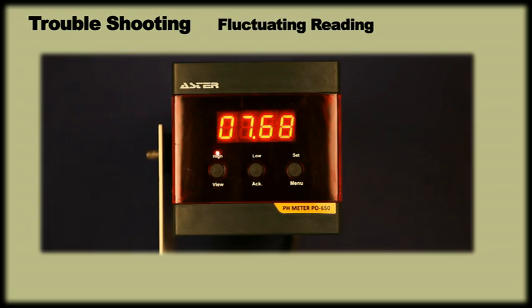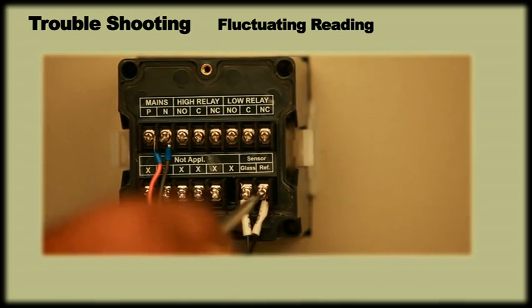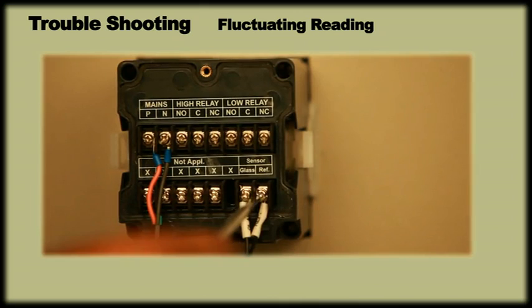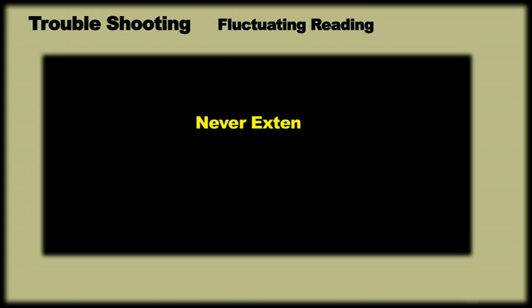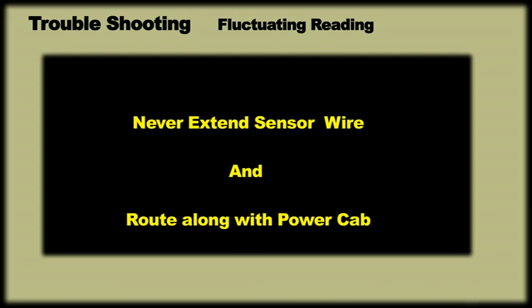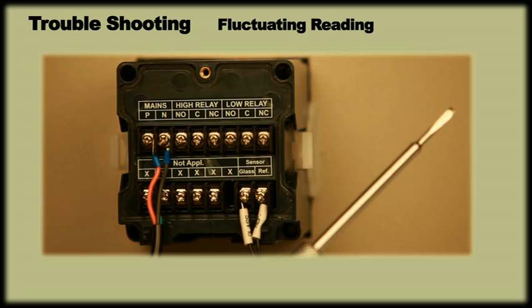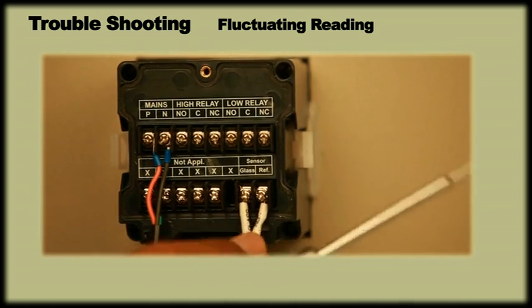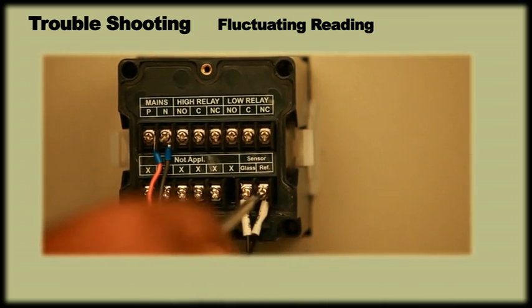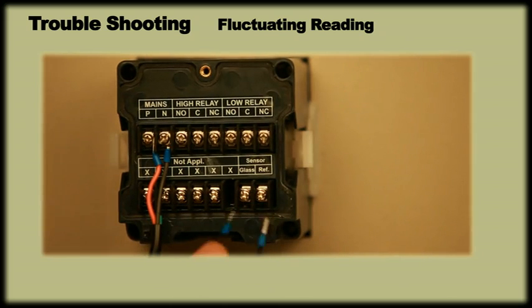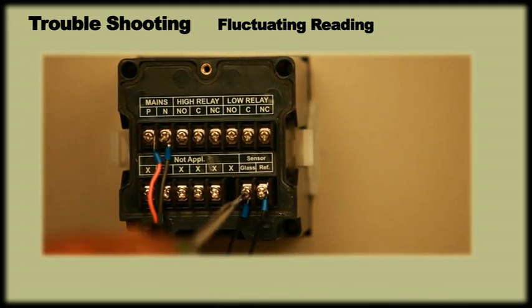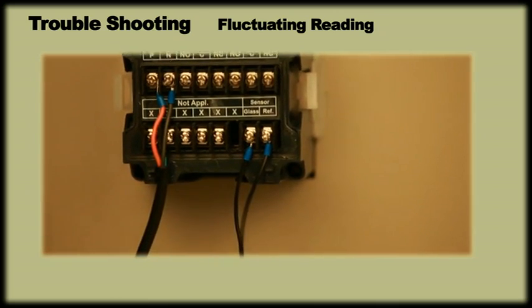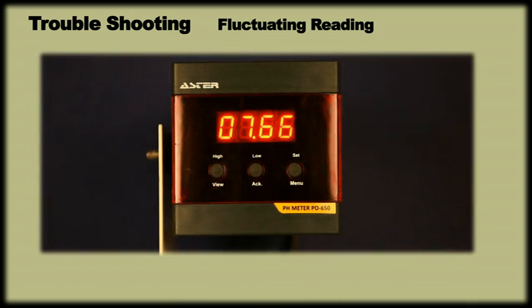If meter reading is fluctuating, ensure that the sensor cable is directly terminated on indicator terminal without any extension joints in the cable. See if there is any loose wiring. If sensor wire is routed along with power cable, then isolate the sensor wire. It could also be because the sensor is not able to send signal to the meter. In that case, disconnect the sensor from the meter by removing the wires and short sensor input terminals. Check the reading. If the reading is around 7, then contact the nearest service center.